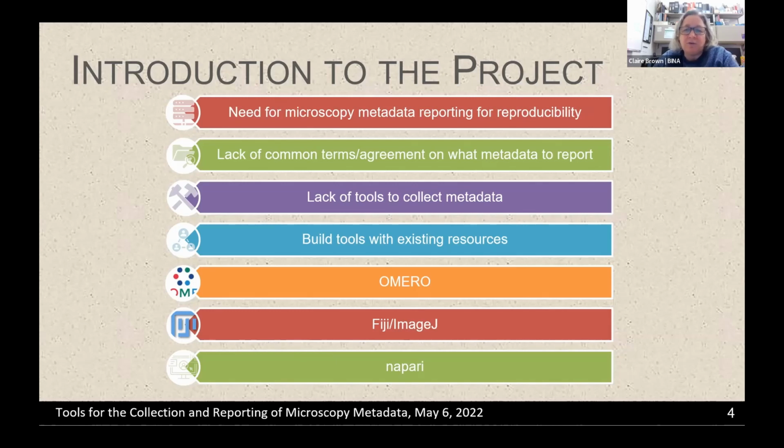And we'll tell you a little bit more later about another project where we're working on adapting it for napari. And then, as Caterina has mentioned earlier as well, the idea is to integrate this with Micro-Meta App so that you'll have all of that metadata in your data management system as well. And there's plans to also extend it to include instrument quality control and standards.